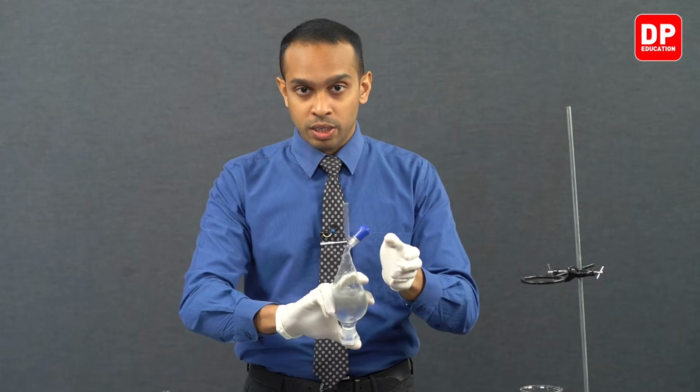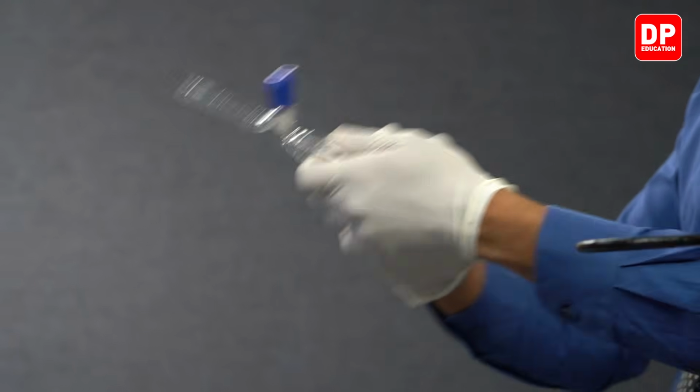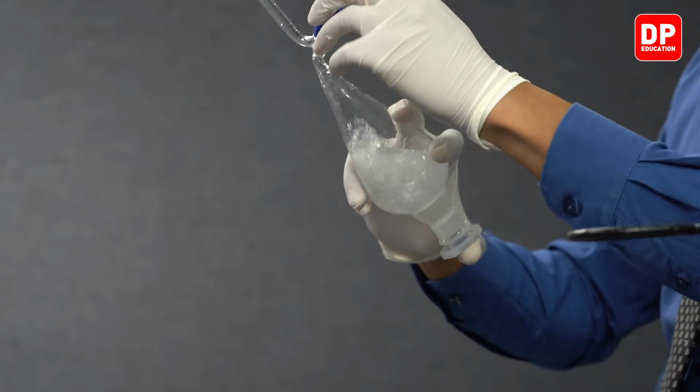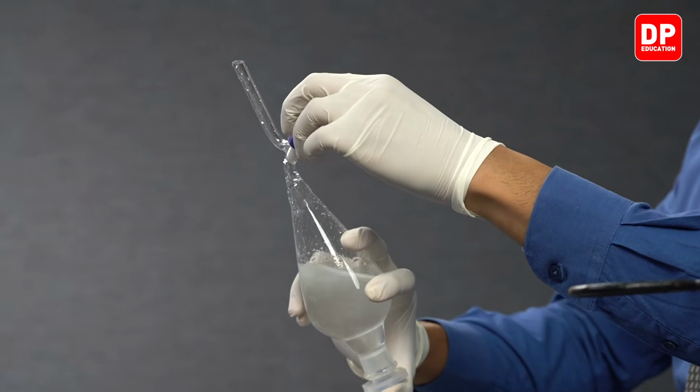You should not allow the pressure to build up inside the separating funnel for too long. Now we have mixed it really well.